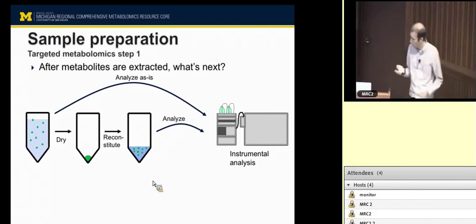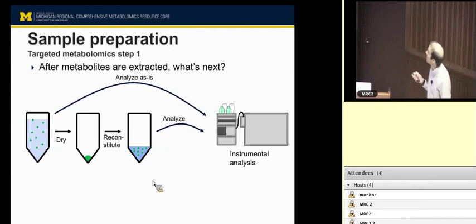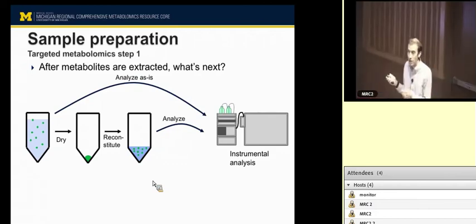So what is metabolomics? Metabolomics then is the attempt to identify and, importantly, quantitate in one way or another all of these species, all in quotation marks. Can we really measure every single thing that is in a biological sample? No, we likely can't. But the goal is to get as close as we can, or as close as you need to be for your study.